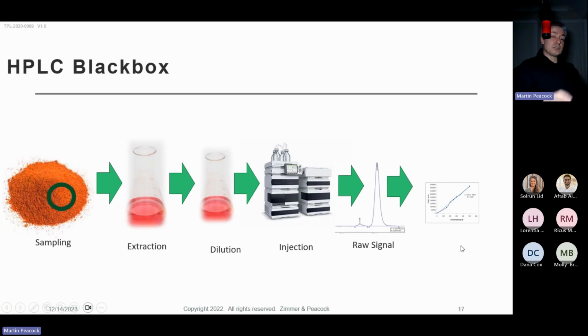Now, the reason I bring that up is because you don't know when they last calibrated that machine. They may have a procedure that says we calibrate every week, but if they calibrate on a Monday and your results are run on a Friday, that machine is definitely drifting. The thing about HPLC is it is quite a complicated machine. It's quite manual, and as soon as the calibration is done, the machine is slowly changing, and the sensitivity is changing. So you don't know when they last calibrated that machine.